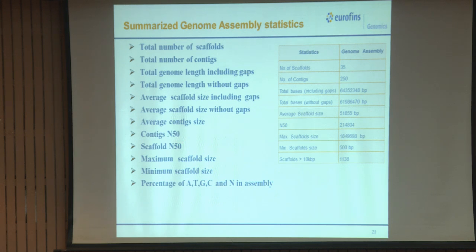So if that is 15, we can find out what is the exact size we are seeing. We may have a homologous genome already known, or else we can find out the genome size from any of the existing ones, or we can also identify it in silico based on k-mers. So, there are softwares available to identify genome size in silico. It might not be accurate, but yes, we can identify it and see. So, if we do not get any clue, we do identify and try to be close to that particular size.